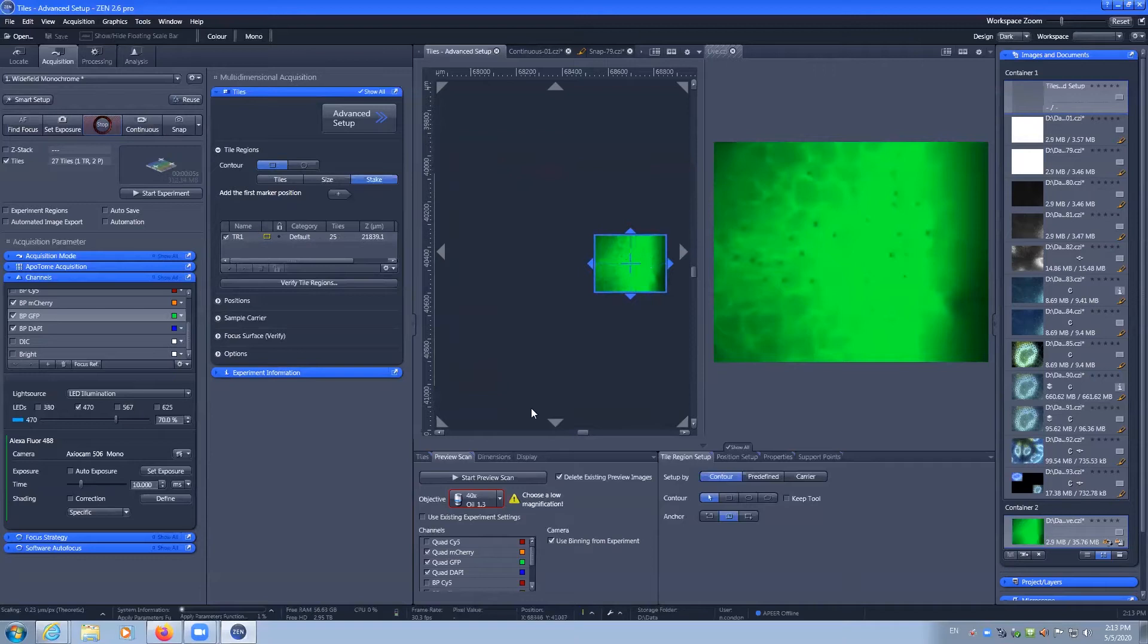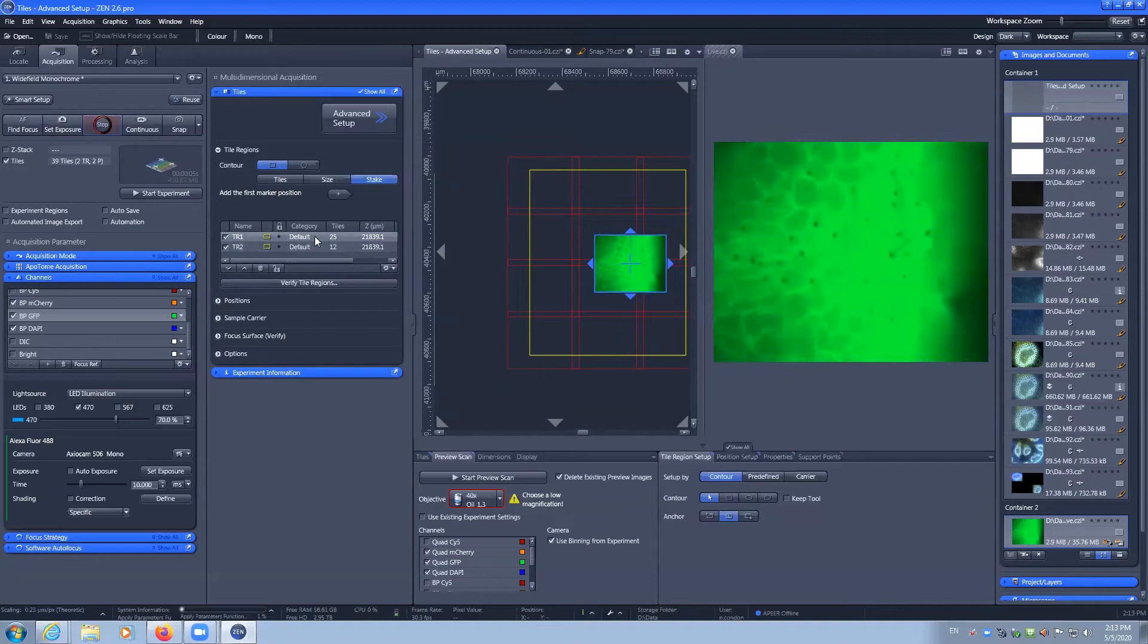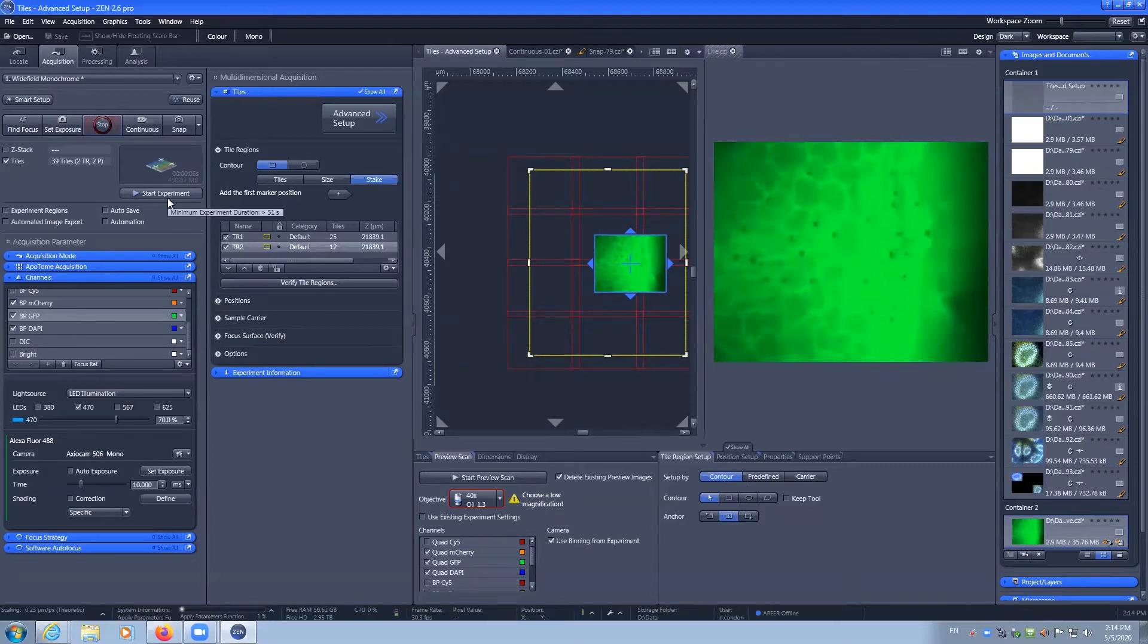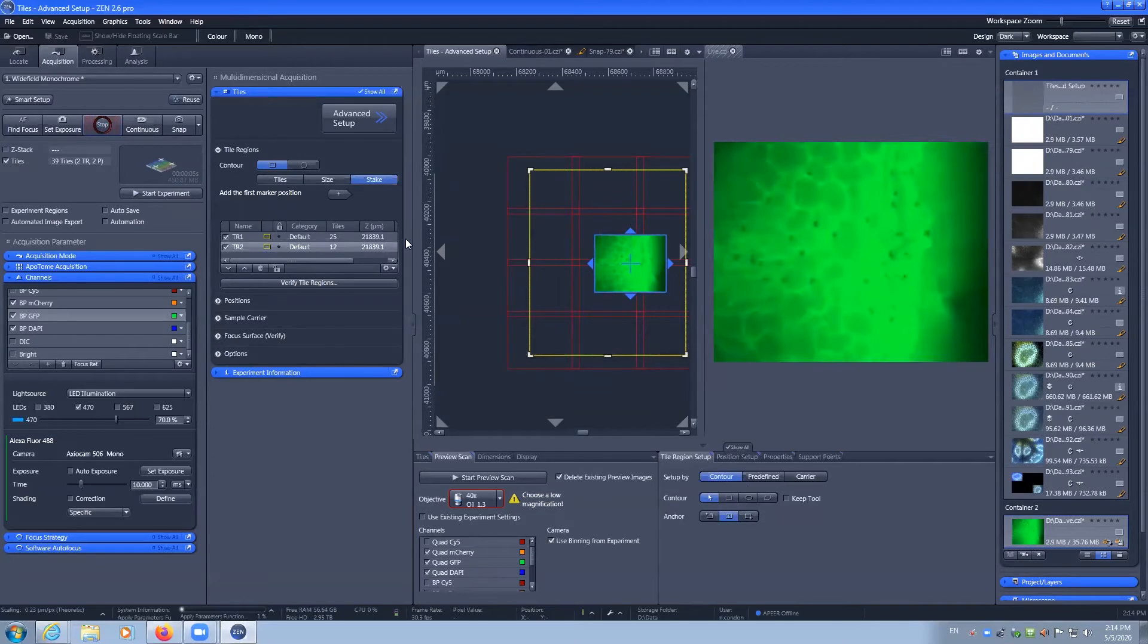And we can also add in an additional tile region over here. So you can capture multiple tile regions within one experiment. These will be saved as two separate files, one of 25 and one of 12 tiles.